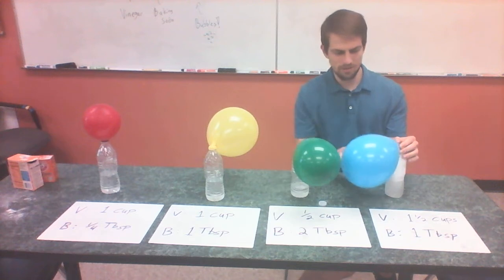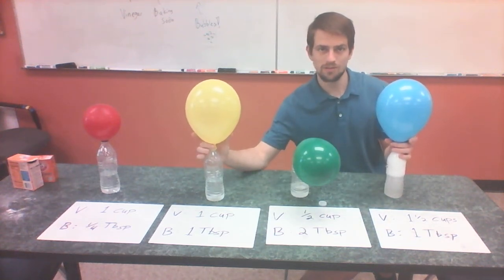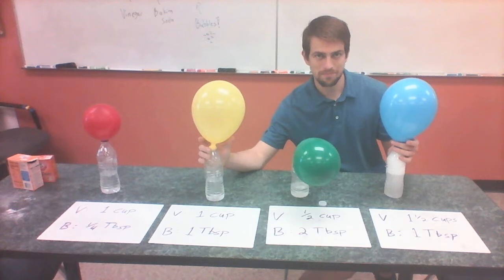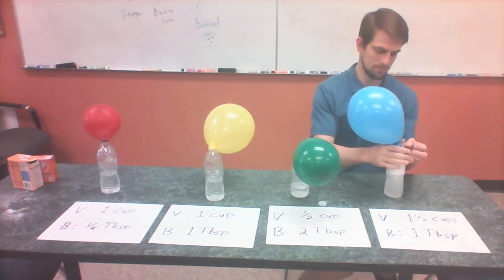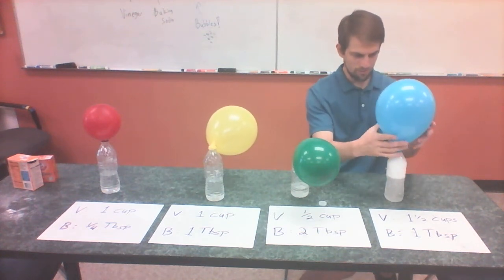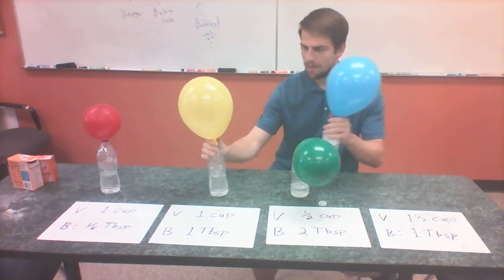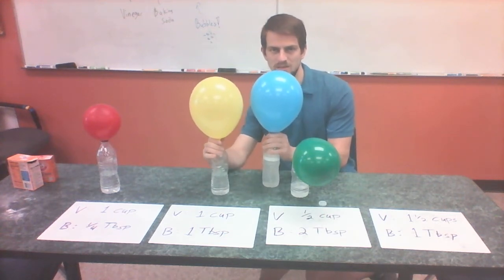So let's see, is it going to get bigger than our yellow balloon over here? I don't know, it's looking like it's about the same size. The reaction's not done though, so it might keep going. We'll see. Shake it up, make sure it's all reacted. Still plenty of bubbles in there. So it looks to me like it's actually about the same size, maybe slightly bigger, but pretty much the same size as the yellow one.